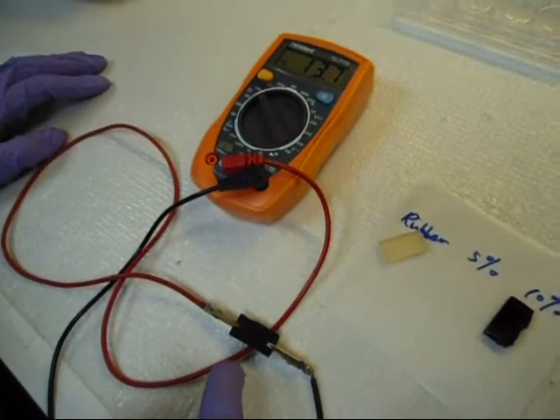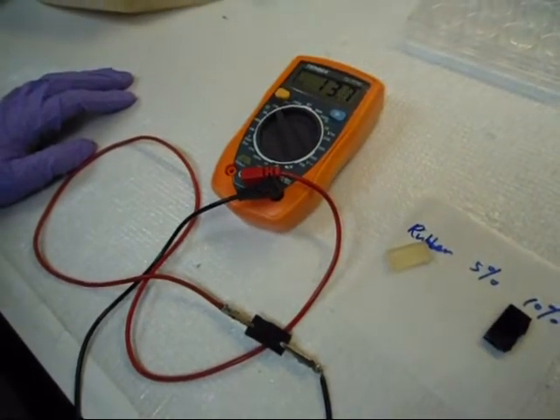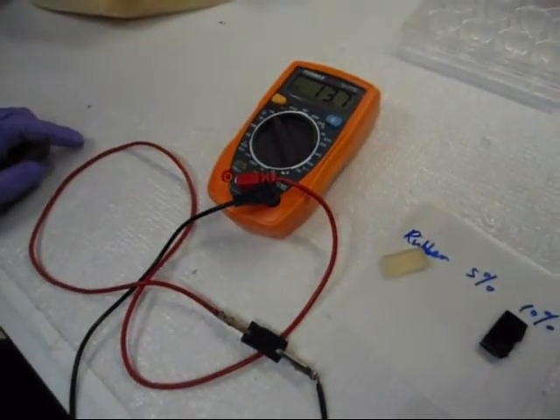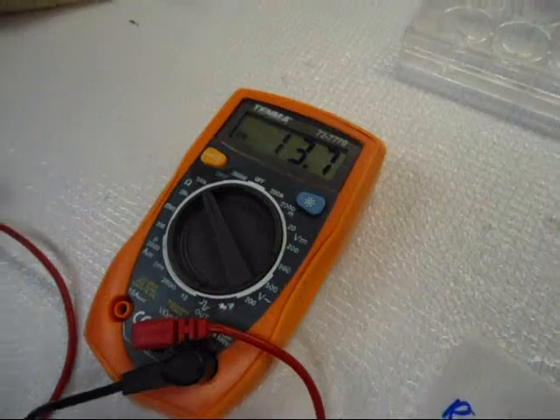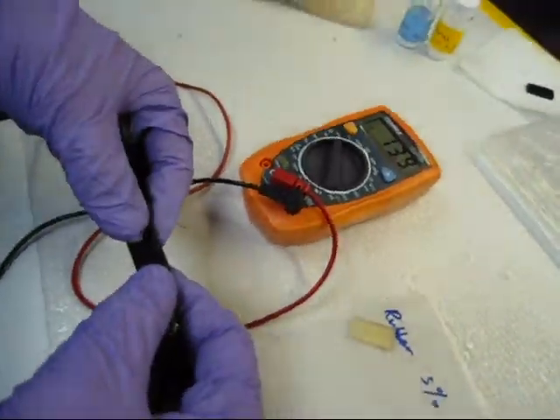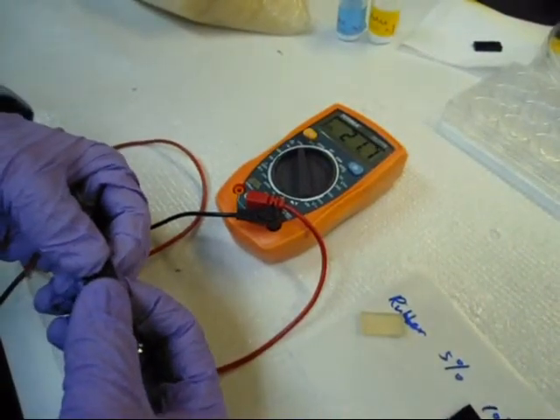This is a conducting rubber bar which contains 5 weight percent of graphite. As we can see, if we don't apply any force to it, its resistance is about 14 kilo-ohms. Now, we are going to apply some force into it. We can see its resistance largely increase.